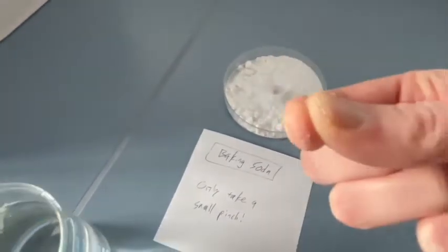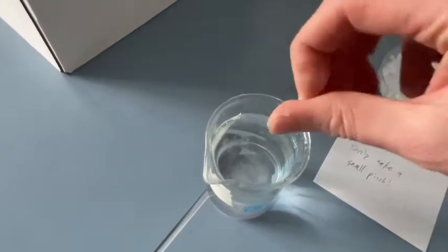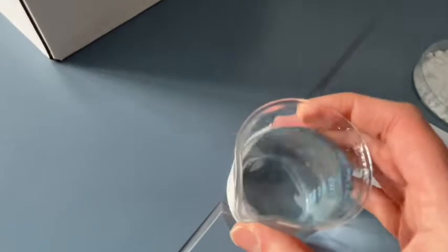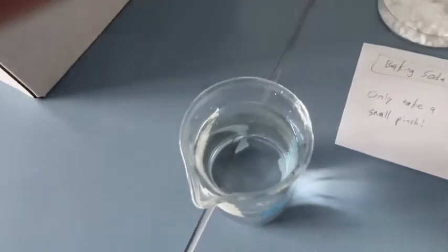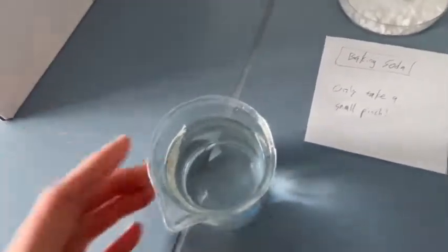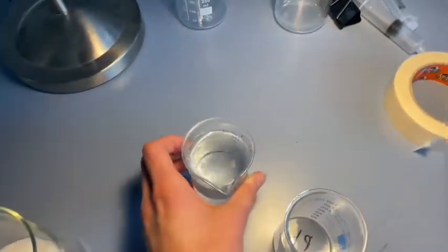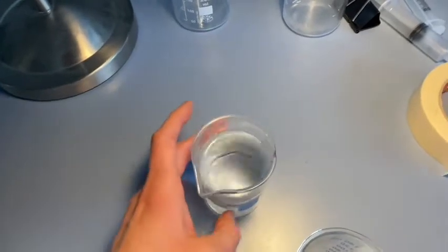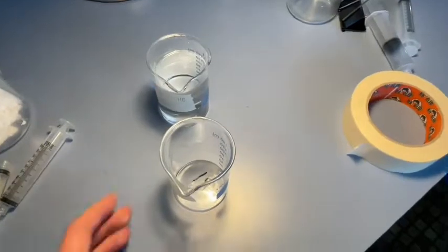The students can just take a pinch of the baking soda and put it in their water. Really, it's not that much at all. It should start to disperse there. They can swirl it around just a little bit without spilling anything. That baking soda is going to do a chemical reaction that'll produce some carbon dioxide gas that'll be dissolved inside of the water. That's going to help boost photosynthesis. It's going to give it some more dissolved carbon dioxide so that it can do some of the reactions, okay?